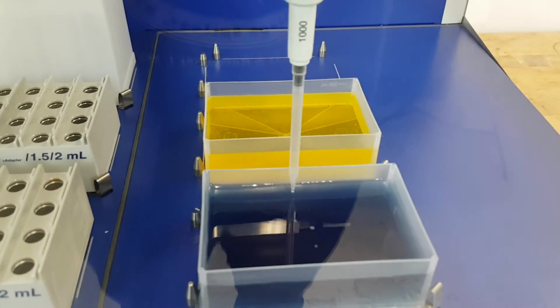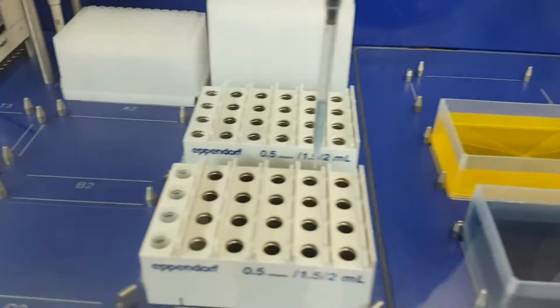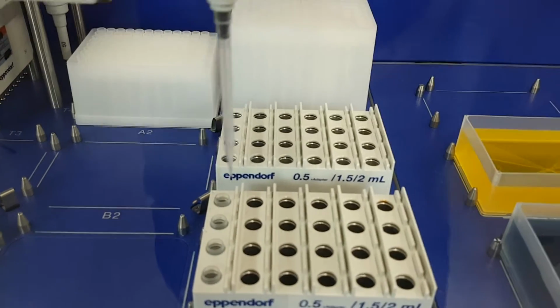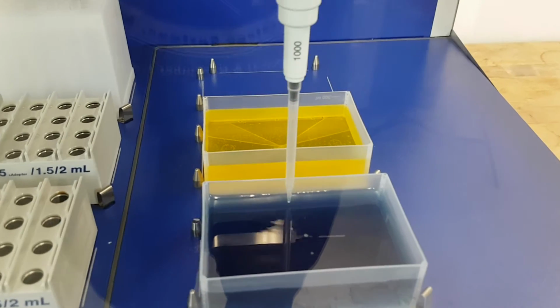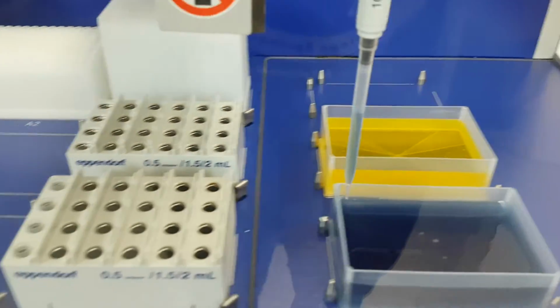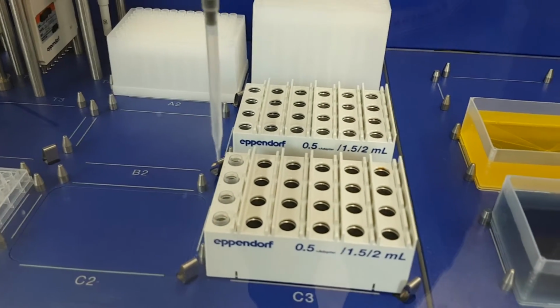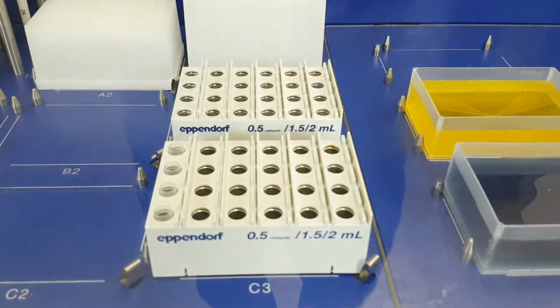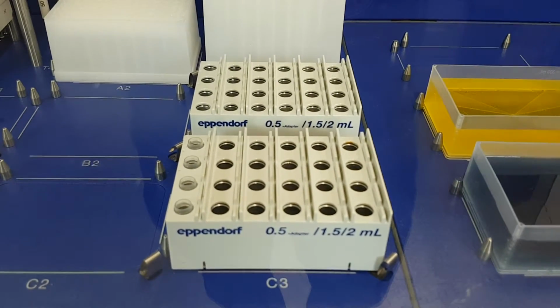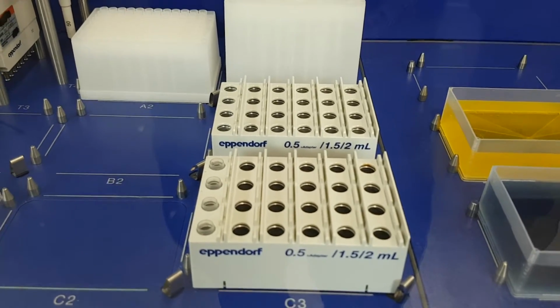Next, 500 microliters will go into the third tube. You can see that's right around the amount of the yellow liquid that was dispensed. And now a little bit more, 750 microliters, will be added to this tube. So now we finished the demonstration of how the single channel pipetter works. And we will continue on to the grabber.